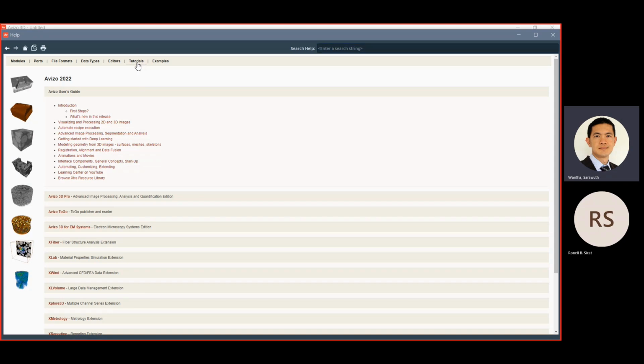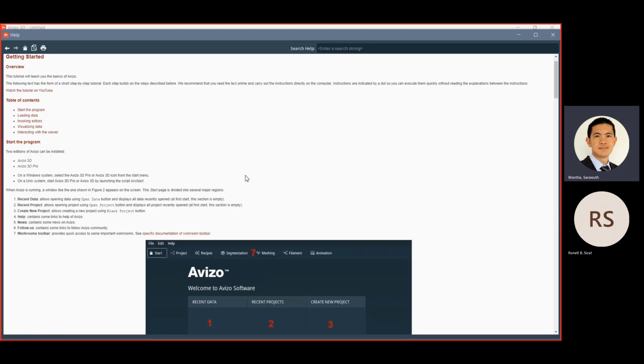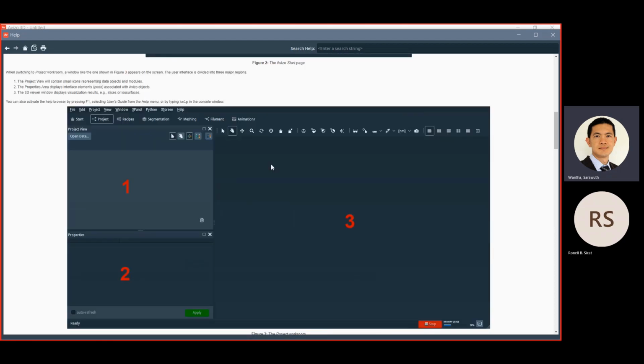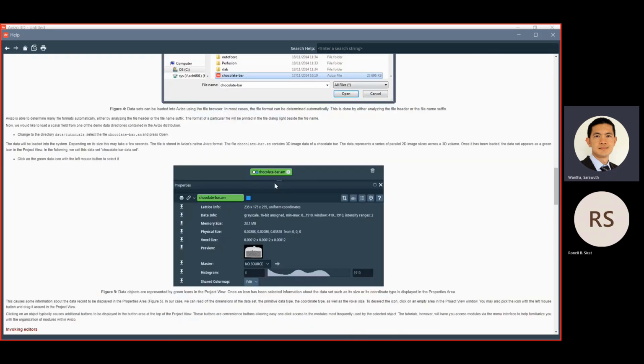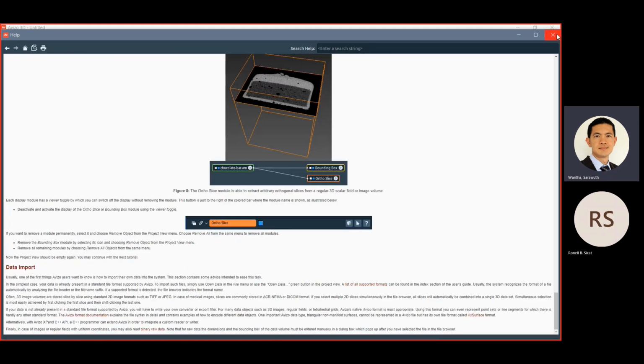So you click on tutorials, and if you are connected to the internet, you can select the YouTube Learning Center of Avizo. You can also go to, for example, Getting Started, and then they will explain to you what the interface is and what I just explained to you before. Try to load a dataset, attach some visualization, and so on. You can consult it.